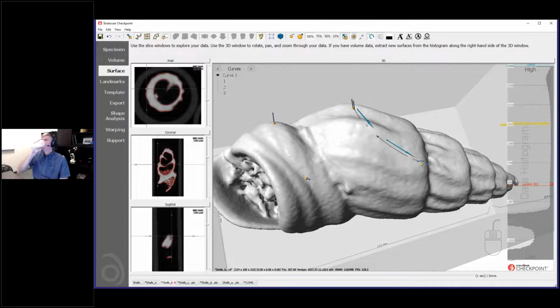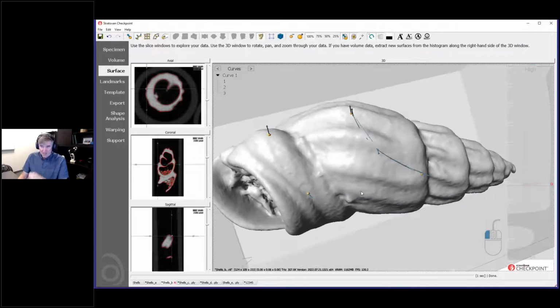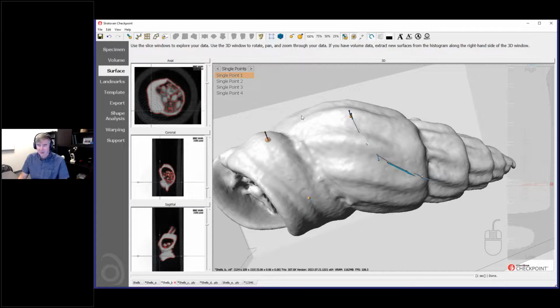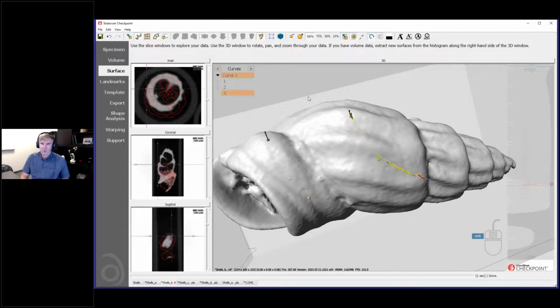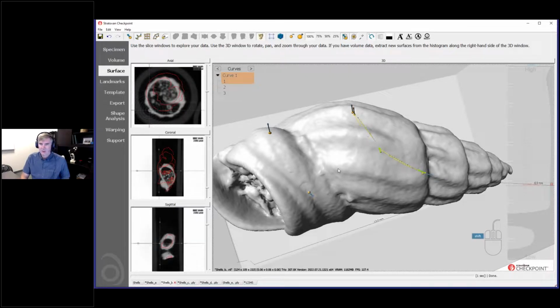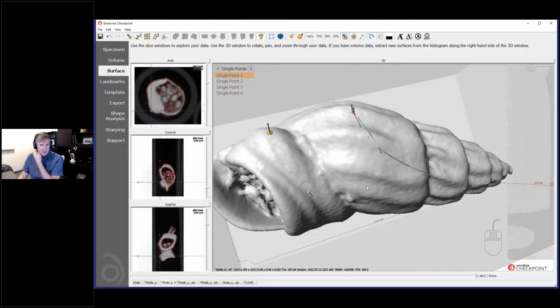David, can you show how you're switching between landmarks with hotkeys? I'm not sure we made it through all the questions that came in. You can select a point and then hold down shift and use the arrow keys, which allows you to zip through all the points. You can see I'm holding down shift here, and then I'm clicking the arrow keys as I go through these. So that's a way to do hotkeys. That was a request that someone had.